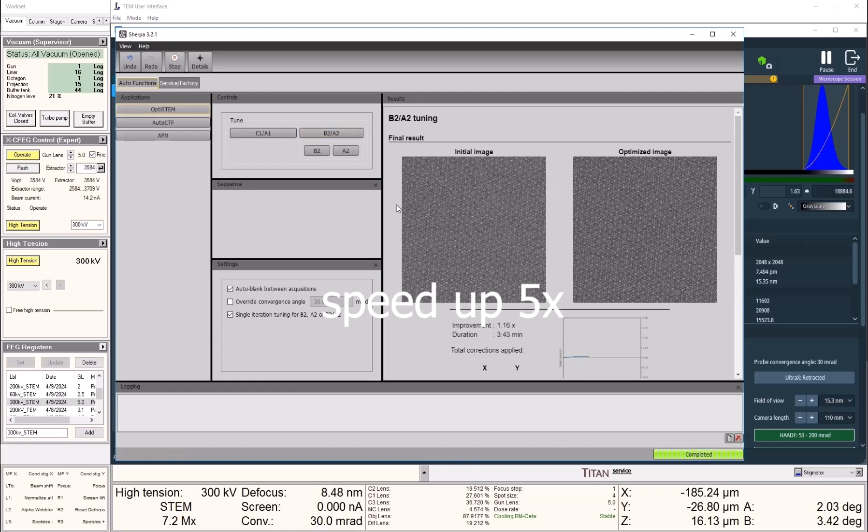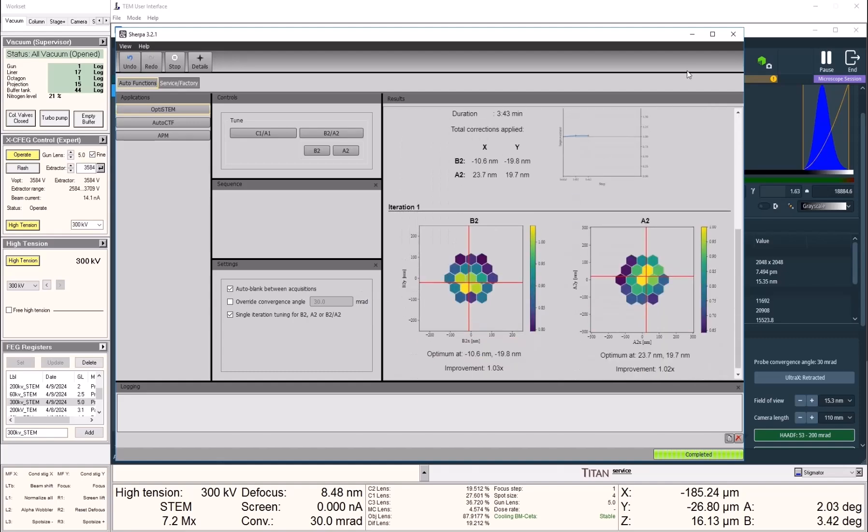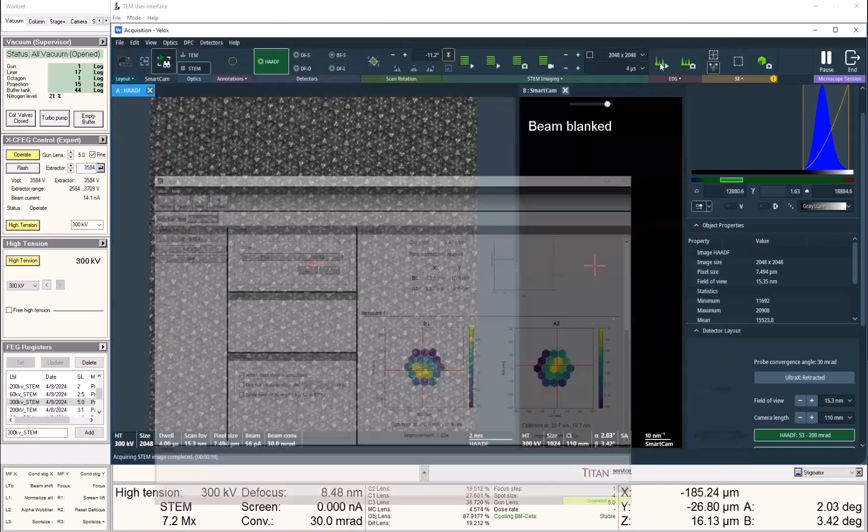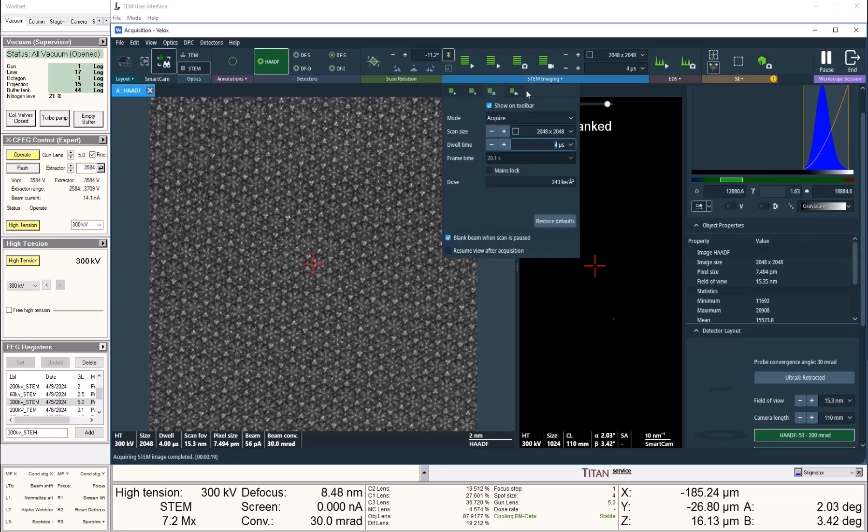At the end, it tells us the resulting image quality is slightly improved in this case. Now we can take another DCFI series of images and sum the 10 frames.